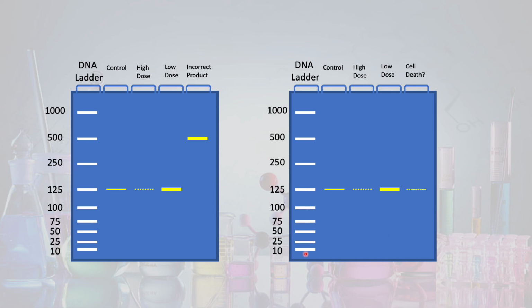So let's pretend for these three samples that we have nice happy cells that are producing normal amounts of mRNA for critical genes. So these could be genes that are involved in energy production or protein degradation. They're called housekeeping genes because they literally upkeep their house, which is within the cell, so they keep it going and as normal as possible.